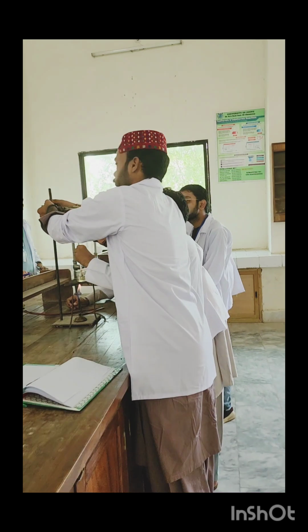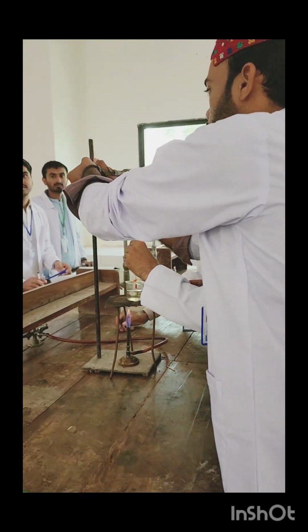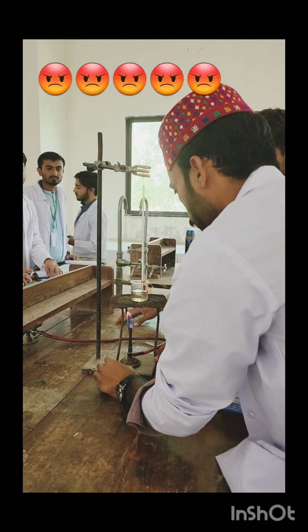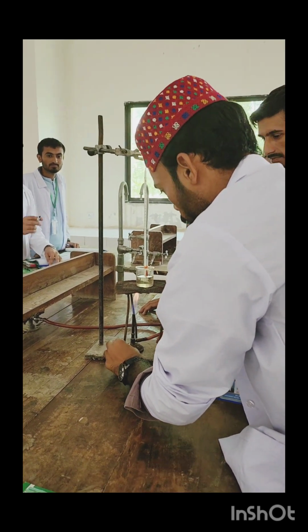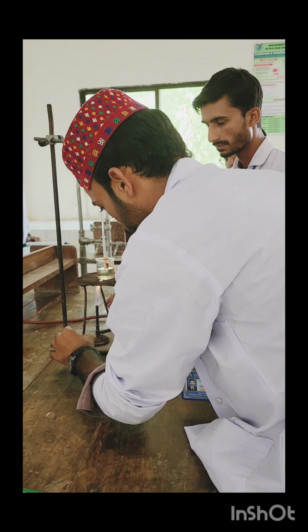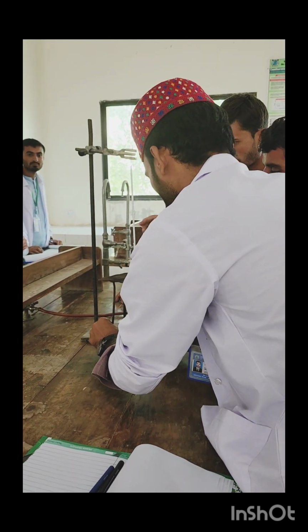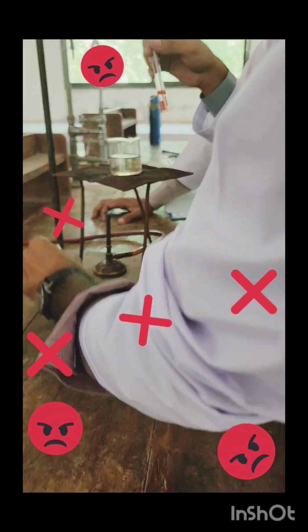Why is your burner on when your assembly is not even set up and the setup is not finished? Why? You need to close the burner. First, arrange your assembly setup properly. Your assembly setup is wrong, totally wrong. Your thermometer is touching the side of your beaker. This is wrong. I explained to my students.